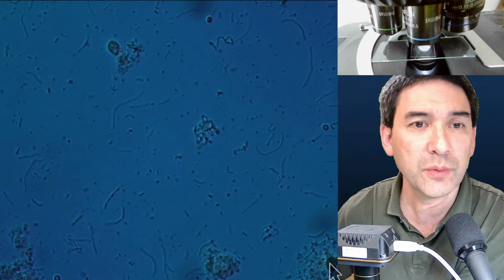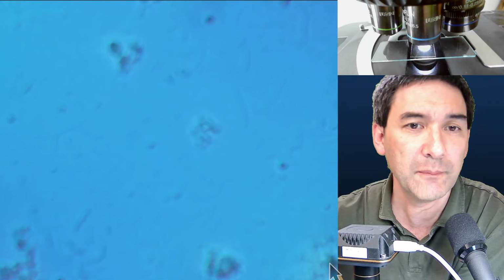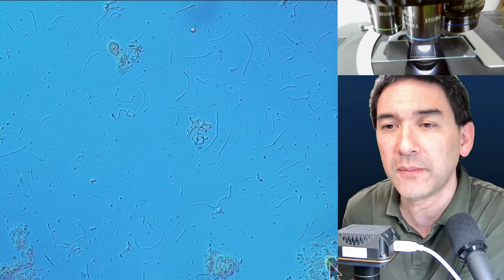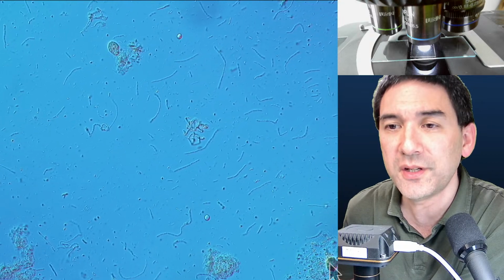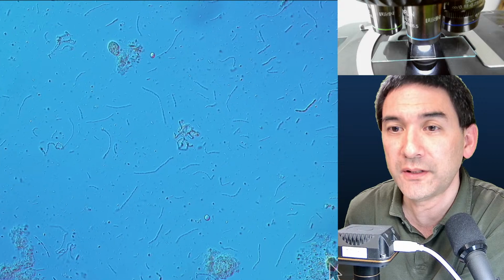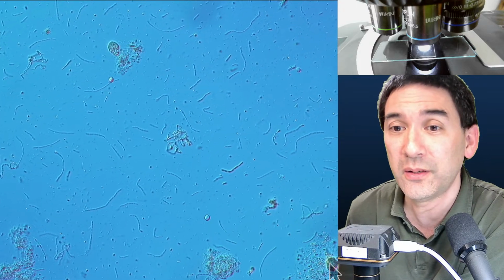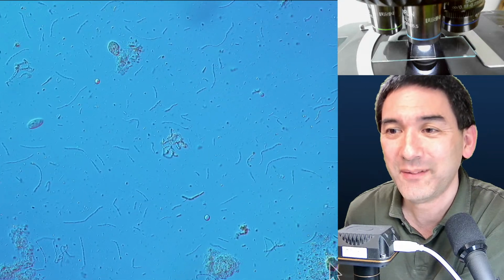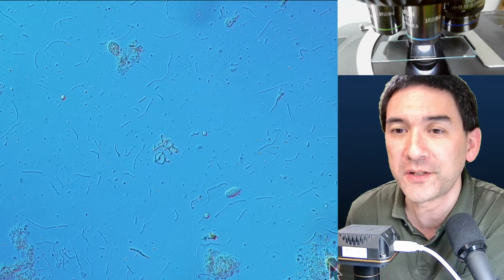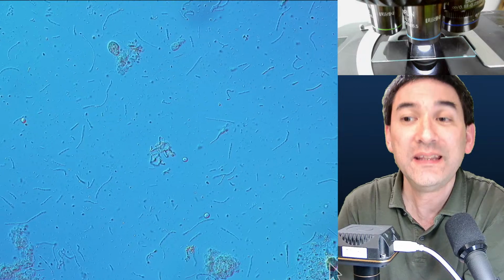Okay, so I just wanted to show this to you a little bit as a reference to the Lego microscope. I'm going to quickly have a look at a couple of comments here. One viewer says they received their camera and 200 prepared slides for a new microscope. I think it's called display magnification. It's also used by many manufacturers of digital microscopes, and it's how they come up with the ridiculous magnifications of 2,000 times, etc.